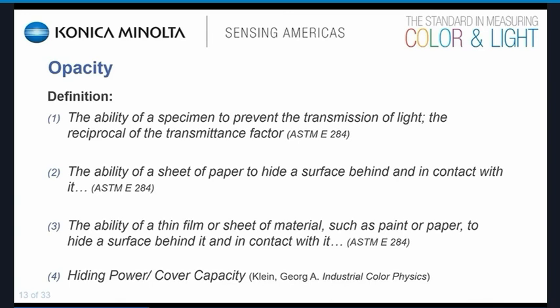So there's several definitions of opacity. The first three come from ASTM, and then I've included a conceptual one from industrial color physics. So let's just go over the one from industrial color physics. It's simply the hiding power or the covering capacity of a material.